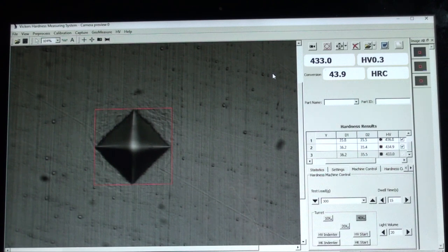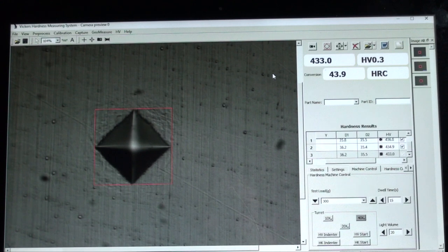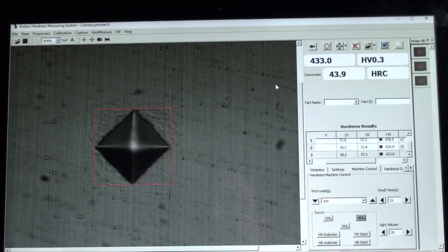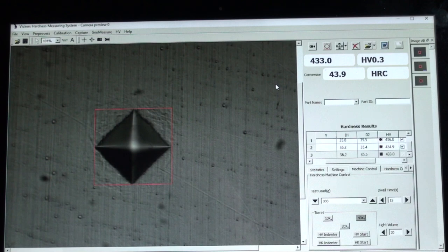If you have an A or C version of the software, there is no auto measure button. One must choose to measure either using diagonals or points on the screen. B and D versions come with auto measure.